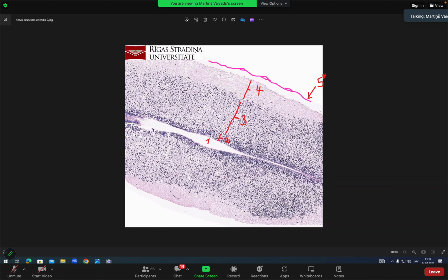Here we don't see skin. There's some slides where there's some additional tissue, but we don't see epidermis. We don't see dermis here in these slides. We can only see them in larger slides if we have the whole embryo. But you need to remember these 3 zones. That's the main detail here. Is this slide clear?